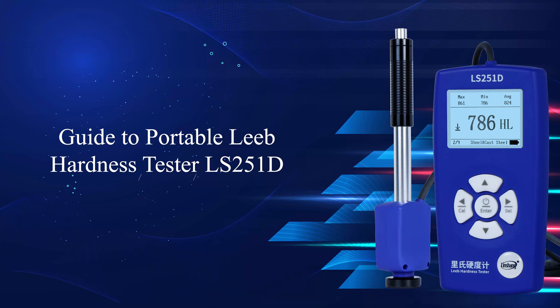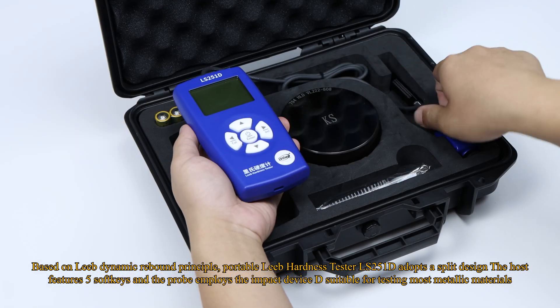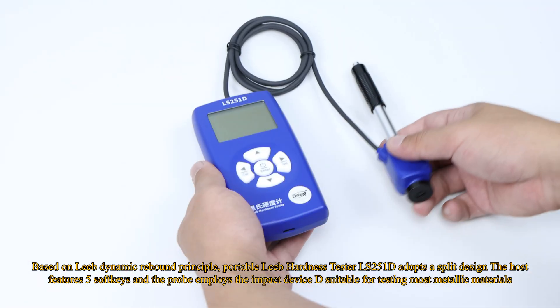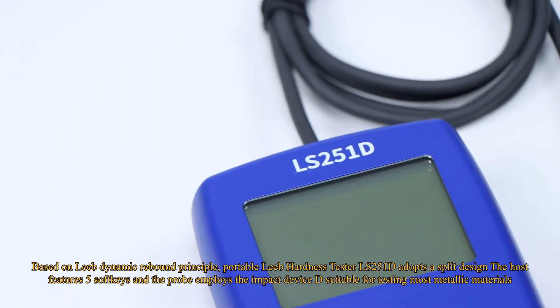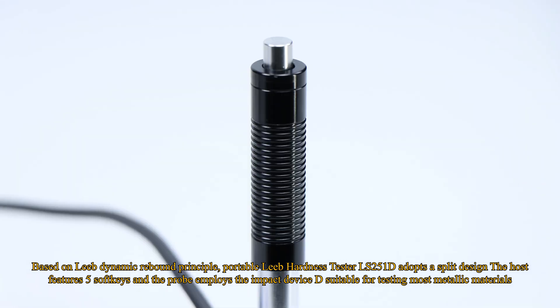Guide to Portable Leeb Hardness Tester LS251D. Based on the Leeb Dynamic Rebound Principle, the LS251D adopts a split design. The host features 5 soft keys and the probe employs impact device D, suitable for testing most metallic materials.